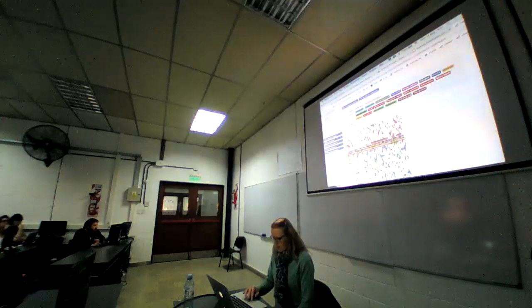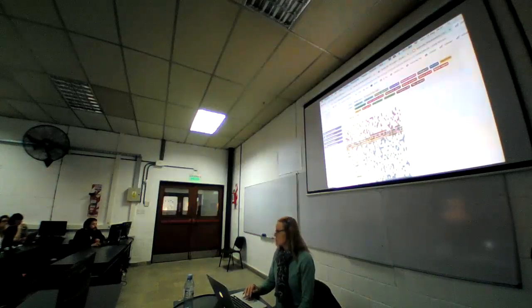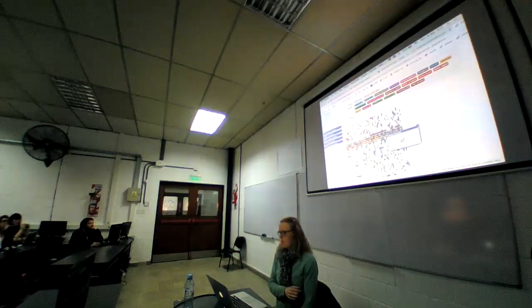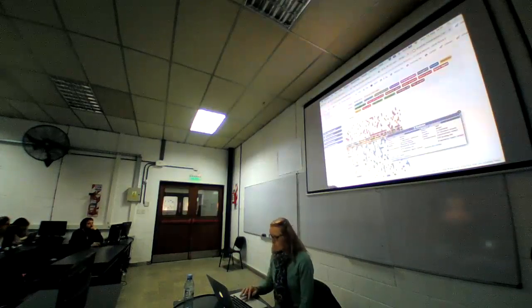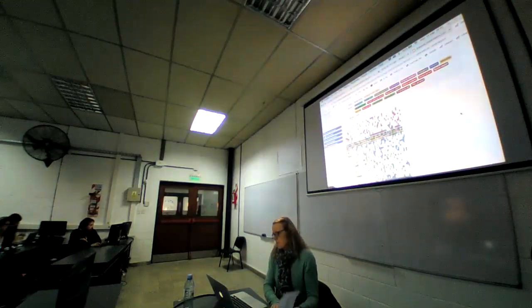You can see that here in my exon, for example, I've got missense variants, which are shown in yellow, and then here this is all intron, so I've got blue intronic variants, and so on. All of these are hyperlinked, so you can click on them and you get a little pop-up window with the variant ID, and then you can go into the variant tab and explore this variant in more detail. This is again just short variants.